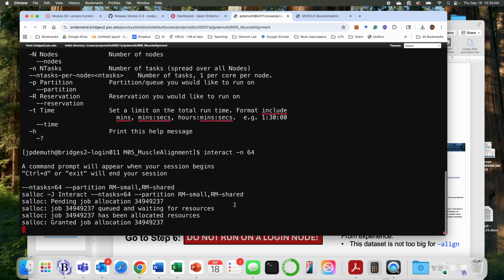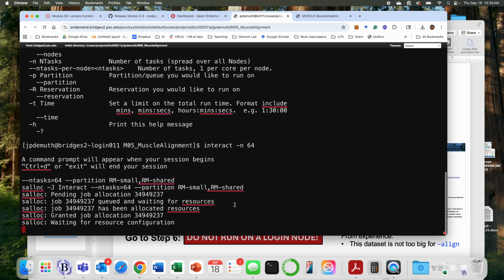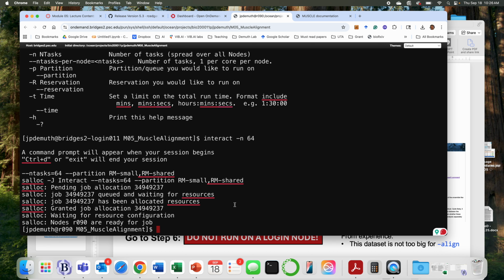So just run it with that stratified. And then first, you have to do this.